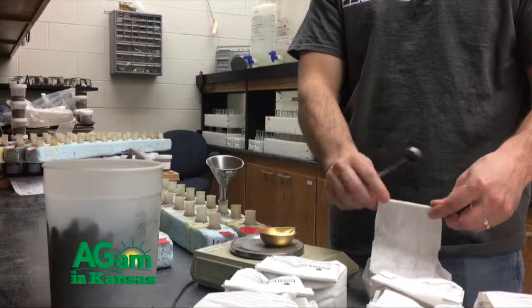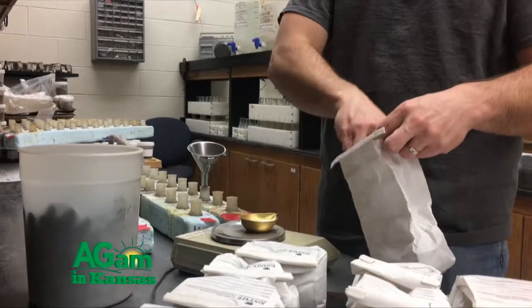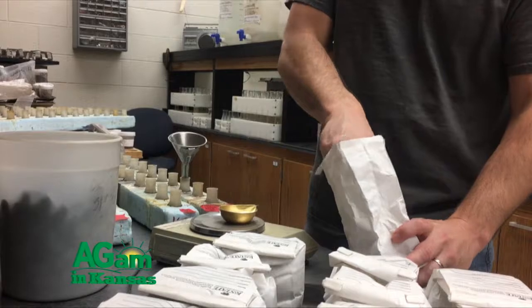From the time you receive a sample, how long does it take before the producer or the homeowner gets the results? Yes, so once the sample gets here, we usually have a turnaround time of about 2 days. So within 2 days, you should get back results. And right now, there's a few ways the results are getting to the customer. One of them is, again, through the website. Actually, the customer can set up an account, and we are giving all the results, all the status of the process in that website.